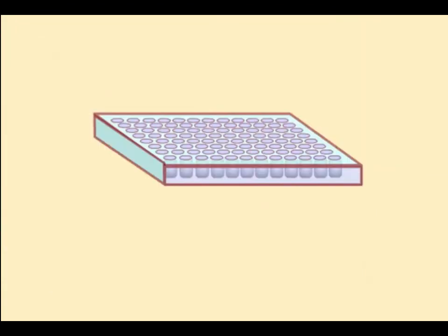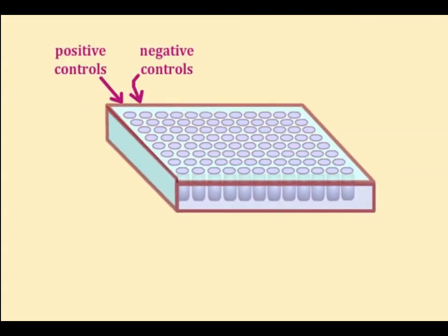At the macroscopic level, the development of color indicates those samples that have second antibody bound to the target antigen in the wells. Thus, the wells that change color are the ones that contain the antigen of interest. In other words, the positive tests.